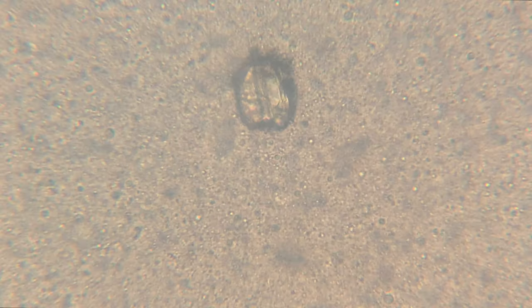One final interesting thing I saw in the baby formula was this crystal. It's probably just some mineral that didn't get dissolved.